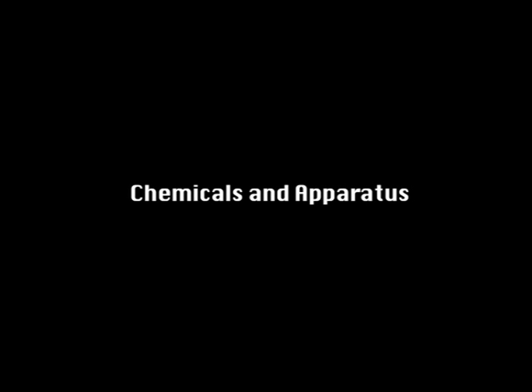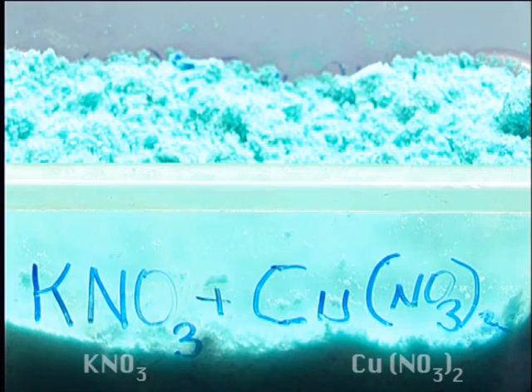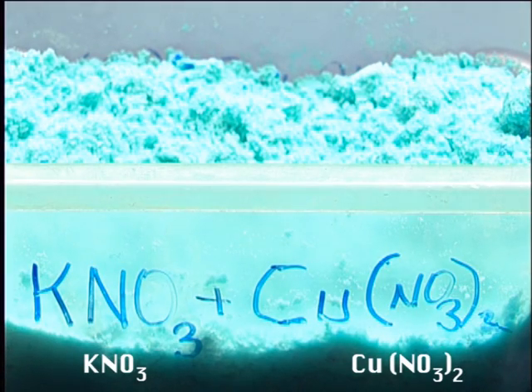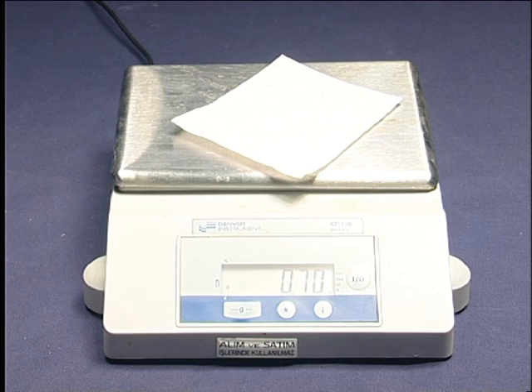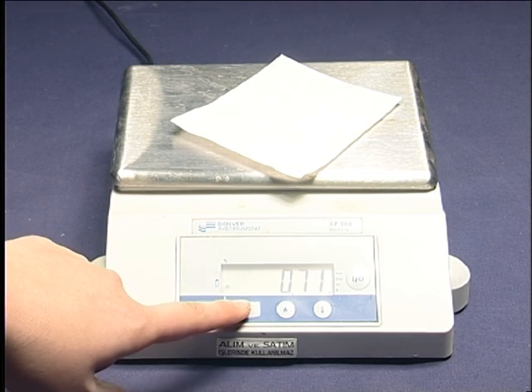Recrystallization. Chemicals and apparatus: mixture of potassium nitrate and copper nitrate. Determine the tare of a piece of paper, then put about 10g of potassium nitrate and copper nitrate mixture.